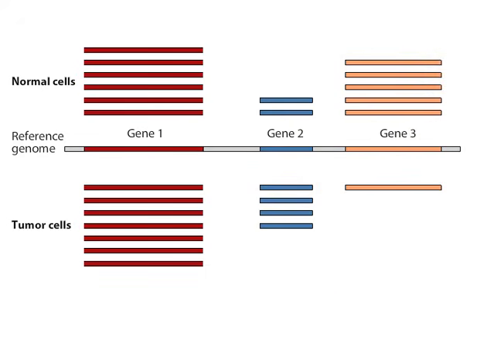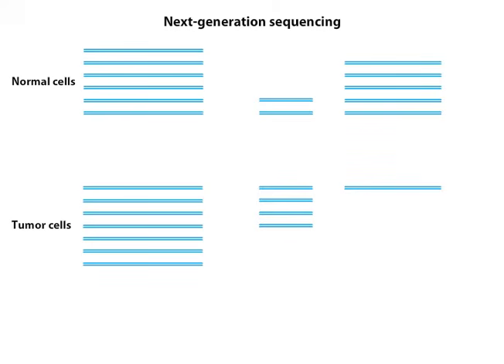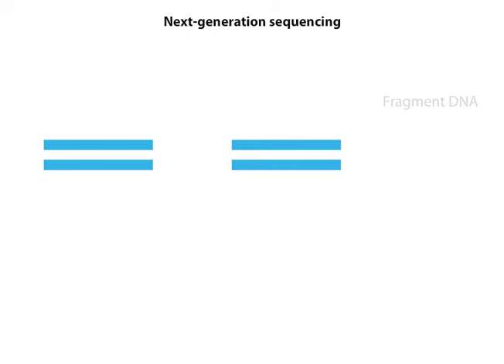After the cDNA is produced, it is sequenced using a next-generation sequencing technique. Next-generation techniques vary, but usually consist of several steps. First, the DNA is fragmented to generate smaller pieces appropriate for sequencing. The fragmentation step, alternatively, can be done earlier on the starting RNA sample rather than here at the DNA stage. The ends of the fragments are then modified by the addition of adapters.